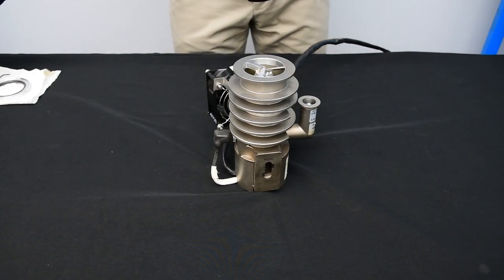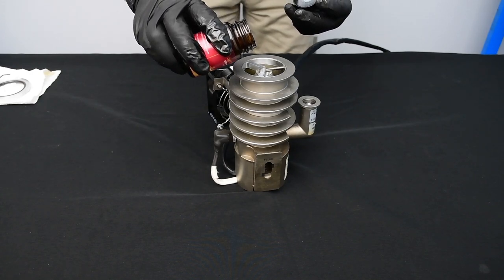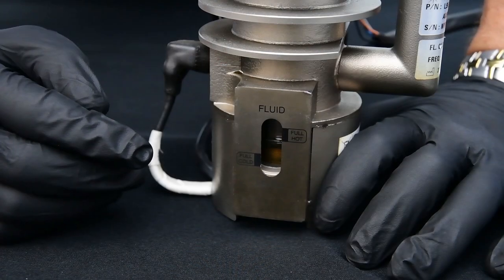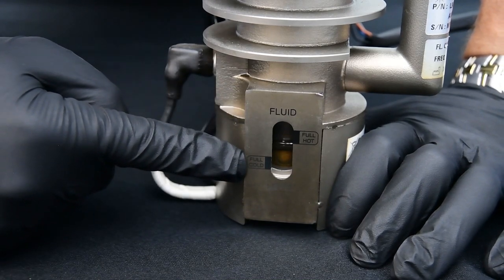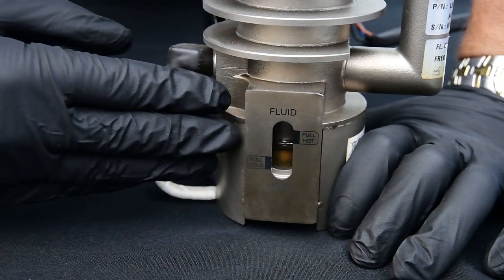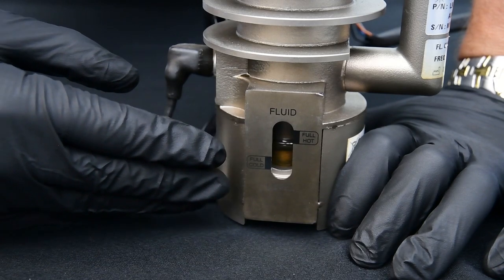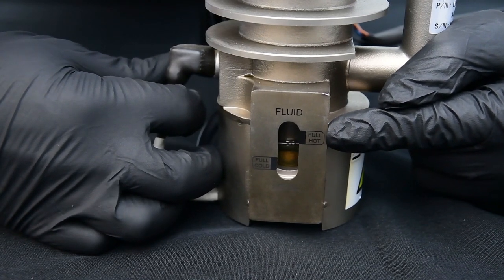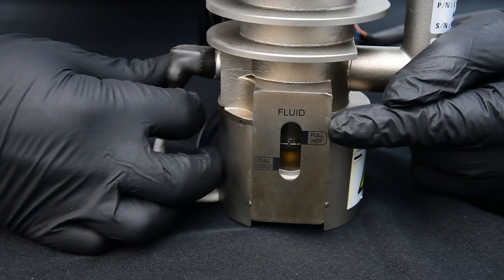To fill the pump we can simply pour oil in right through the top. Now we have two different fill lines here. The bottom is the cold fill line, which I filled the pump to as the pump is cold when I filled it with oil. When we turn the pump on the oil will heat up and expand. This is the reason that we have a hot fill line here, so you can see that the oil level is at the proper height when the pump is operating.